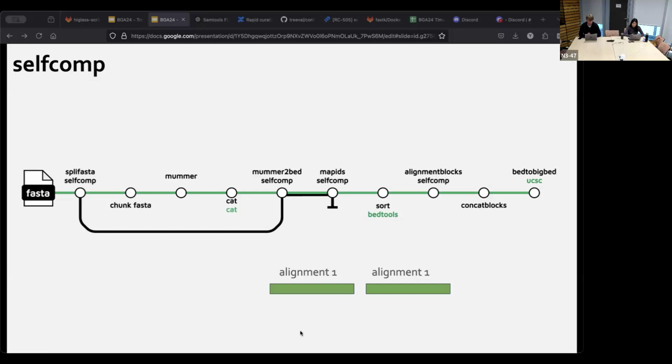So it provides the curators with a clear picture of the potential haplotypic duplication and structural features within the genome. As you can see, there are 2 bars at the bottom of the presentation. And so this is a typical event when you see haplotypic duplications in a genome. So once you see the 2 alignments, after chaining, the 2 chains next to each other and neighboring each other, that might well be a duplication event.